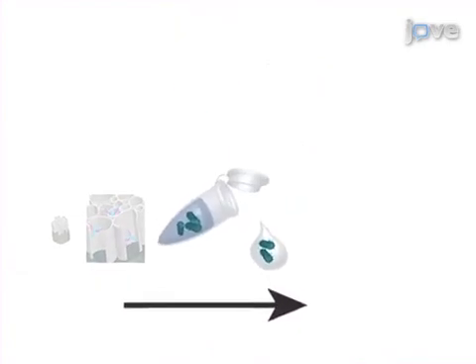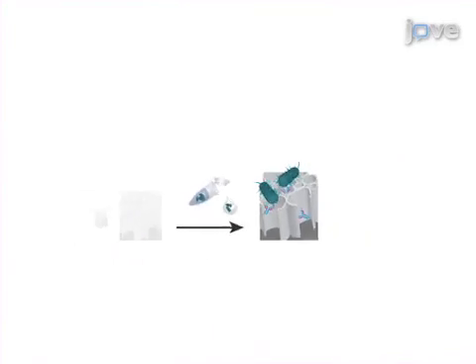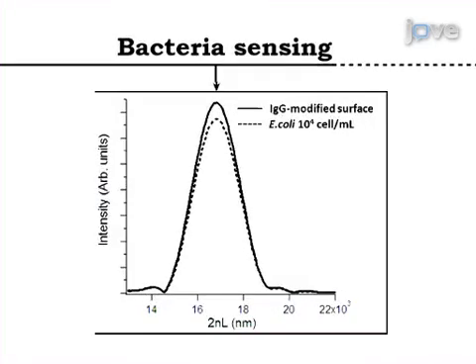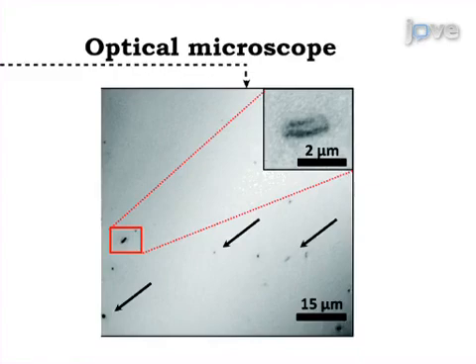Next, the biosensor is exposed to the target bacteria in order to directly capture the bacteria cells onto the antibody-modified oxidized porous silicon surface. Results are obtained that show intensity changes in the thin film optical interference spectrum of the biosensor due to bacteria capture. Light microscopy is used in order to confirm the presence of the bacteria on the biosensor surface.